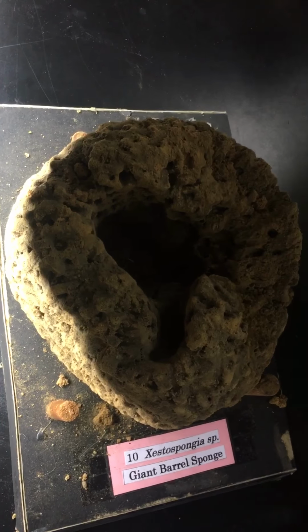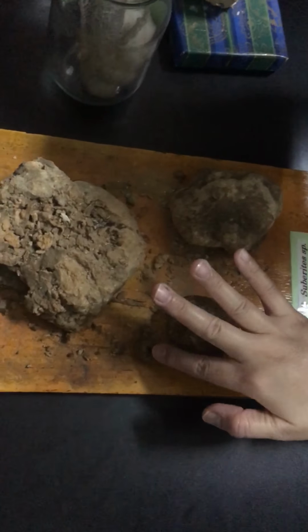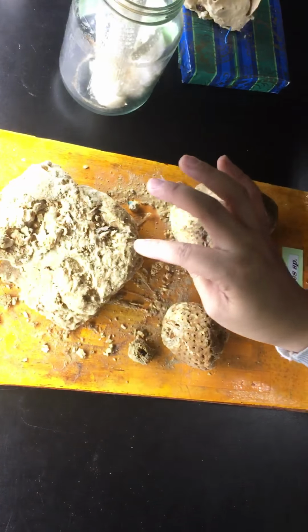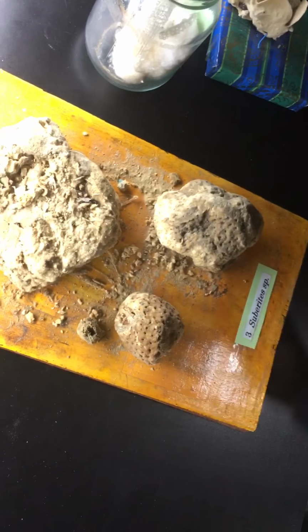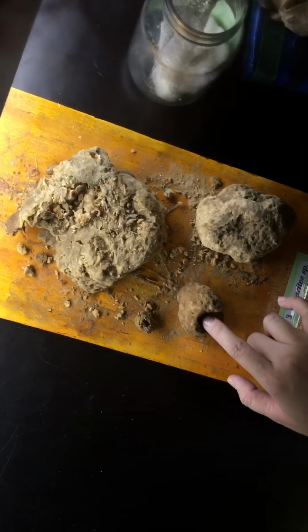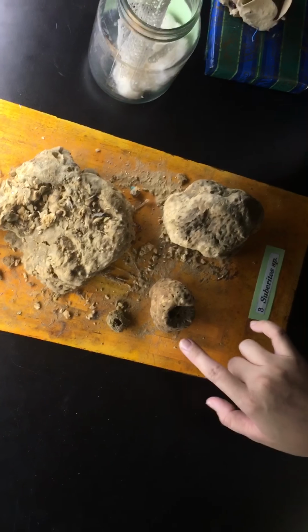And then the next is Suberites. So Suberites is also a demosponge. Notice, just to feel it, but don't do it roughly, okay? Look, it feels like something is sticking to it. That's actually the feel of the spicules. Spicules. Okay? So notice the reduction in the spongocoel. Again, these are the individual ostia.